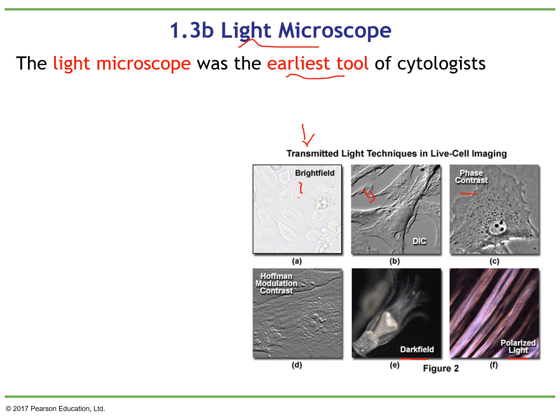If we want to study them, we need to stain them and kill them, or we need to use different optical tools. One optical tool that is very common, that maybe if you are in a healthcare profession you might use, is the DIC microscope. With this one, you use optical tools to play with the light to create a 3D picture. It's not actually 3D. It's like this is a square, and if I play with perspective, this looks like a very ugly cube, but it gives you the impression that it could be three-dimensional.